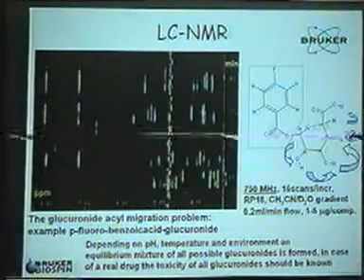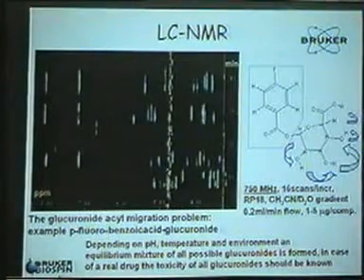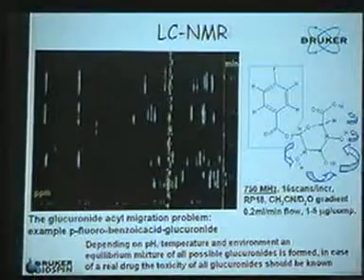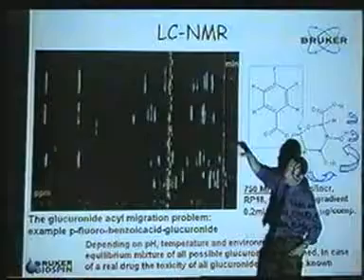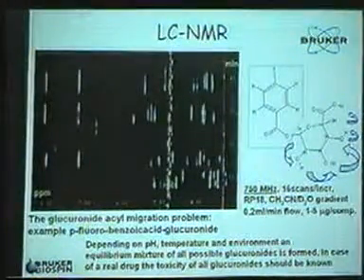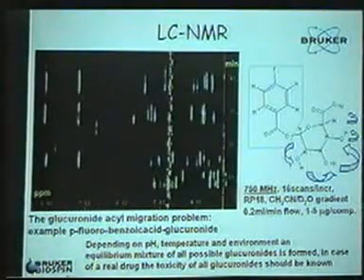And what you see here is an NMR chromatograph. These are all different samples taken at different moments in time with all the same experiment.